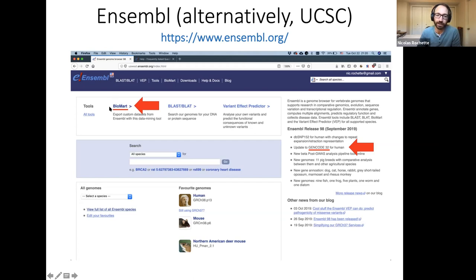just general feature IDs for genome annotations. And it lets you convert IDs to anything really, like IDs from other databases are interfaced with Ensembl IDs. And then you can track IDs over time through the years, like what happened to my IDs that were published 10 years ago. And you can just use BioMart to manipulate IDs and essentially manipulate the changes in the genome annotation.